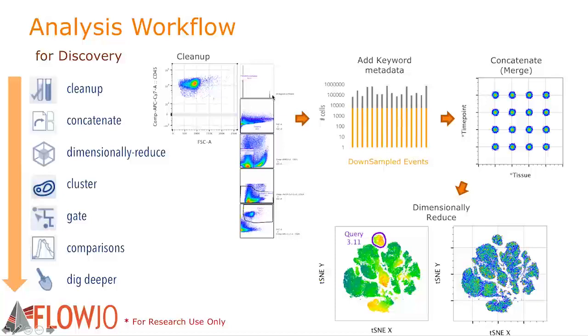So the autofluorescent events and clogged areas that show a decrease in scatter will get removed in this automated approach. And then I'm gating away my singlets and my dead cells and coming up with just a nice population of live lymphocytes. So once you have clean populations, you can actually merge those samples together using a process called concatenate.